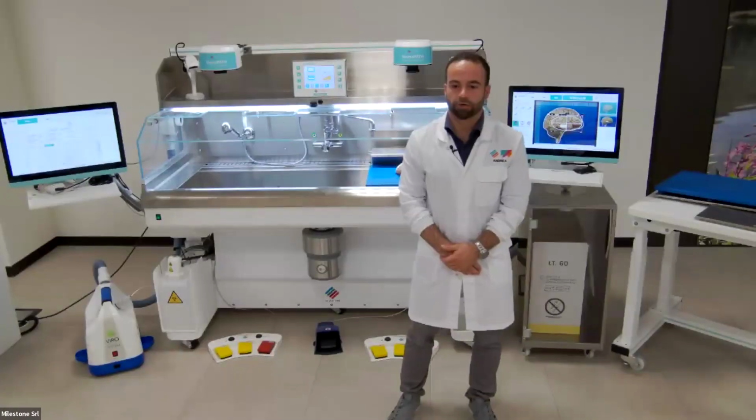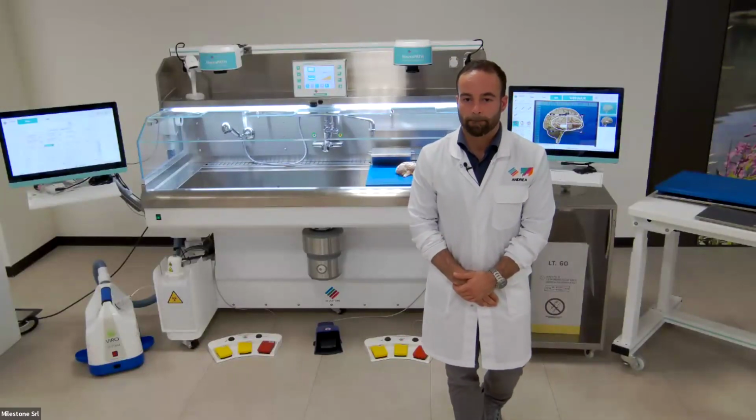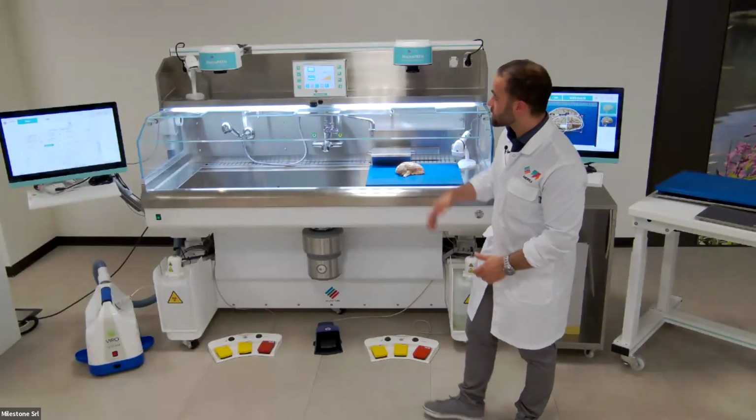Okay, now we have a question which probably comes from someone who already knows our stations. Does the ultragross have a presence sensor? Yeah, definitely. As I told you earlier, there's a presence sensor here.